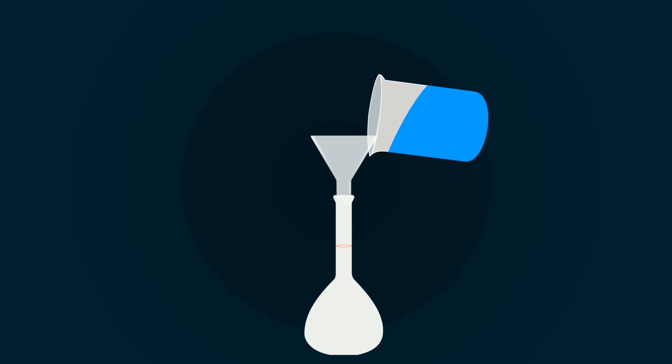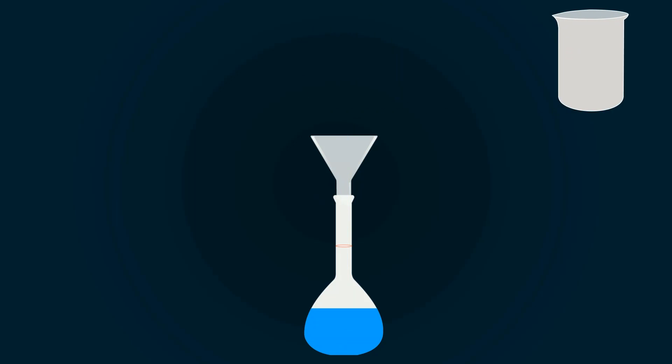Add the solution into the volumetric flask of 1000 ml with the help of funnel. Add more distilled water to get up to the 1000 ml point.